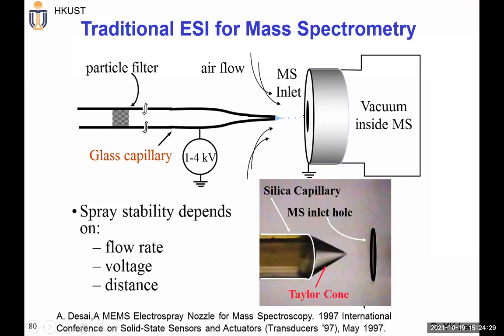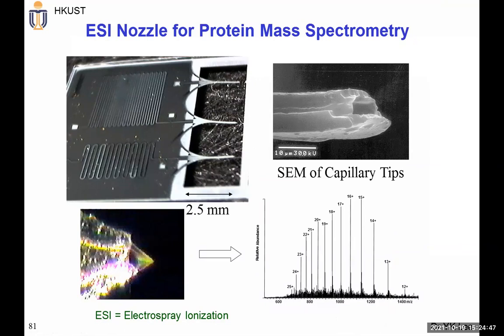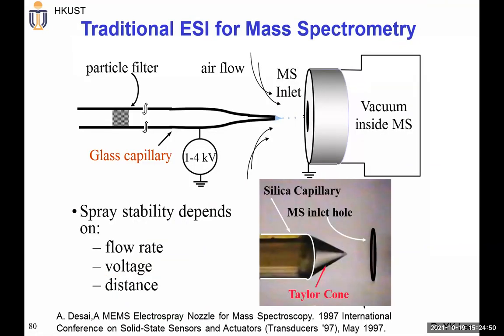It has existed for a long time, but how can we go from traditional mass spec to micro? Why micro, with micromachine-based electrospray? Again they demonstrate this. The key thing here is that once you have a special micro nozzle, you apply some voltage to generate unique electrohydrodynamics to ionize mostly biomolecules, to do ionization.